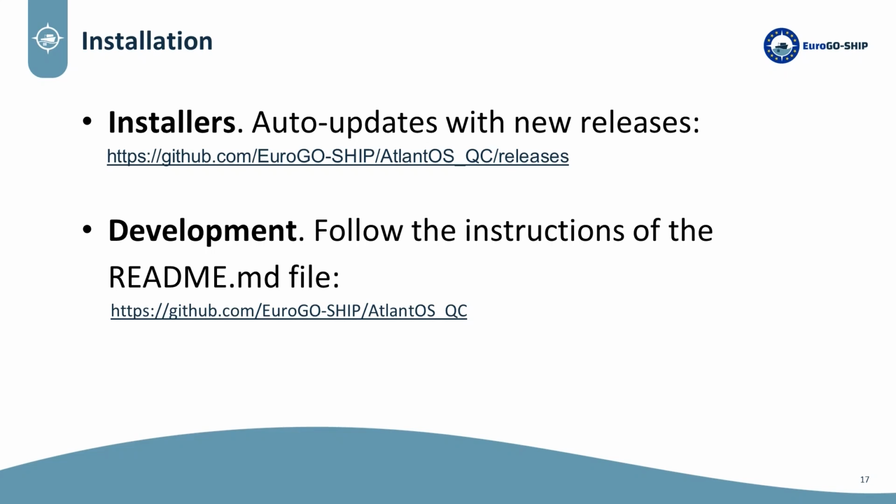Development. You can also install the application from source using the code on GitHub. The README file contains step-by-step instructions. This method is more complex as it requires having Python, Node.js and a package manager like Yarn or npm already installed.